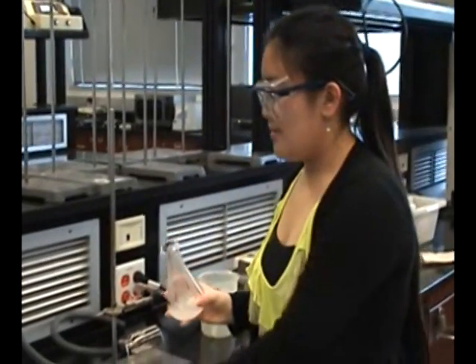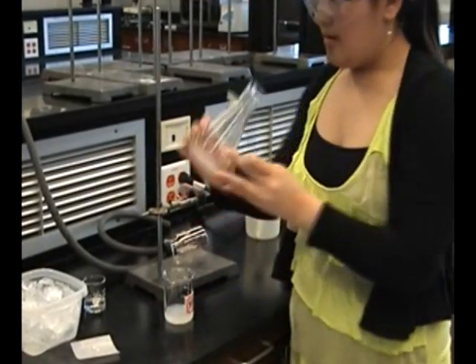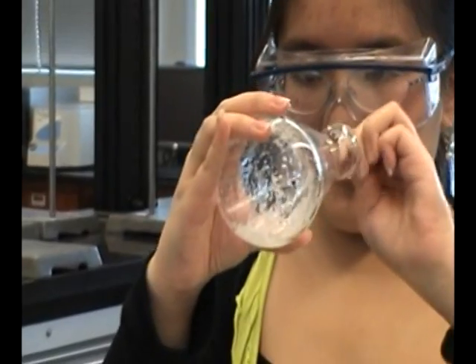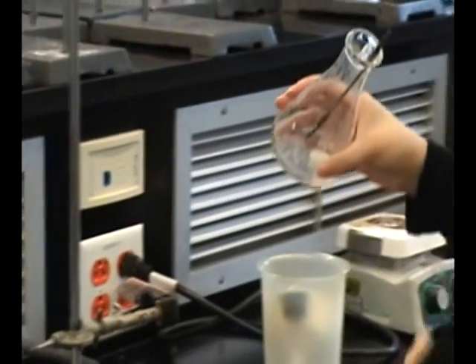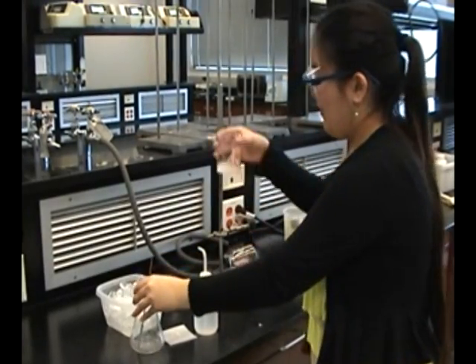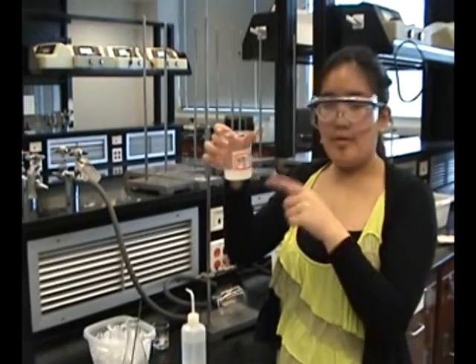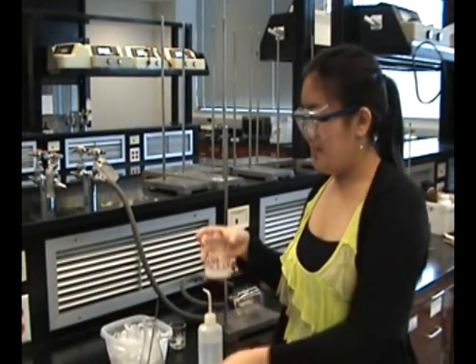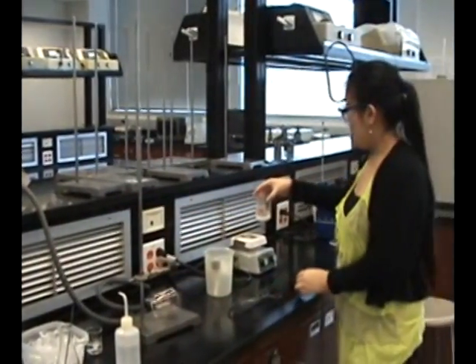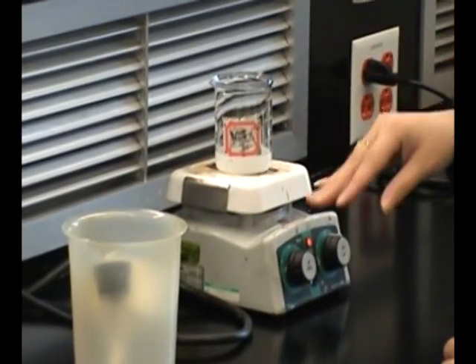What you want to do now is pour this filtrate into a 150ml beaker. You want to get all the acetaminophen from the bottom. You can use a small amount of DI water, but don't use too much. You want to get as much acetaminophen as you can. Note the volume. Put two to three boiling chips in, then put it back on the hot plate. Let it boil until it reaches half of its volume.